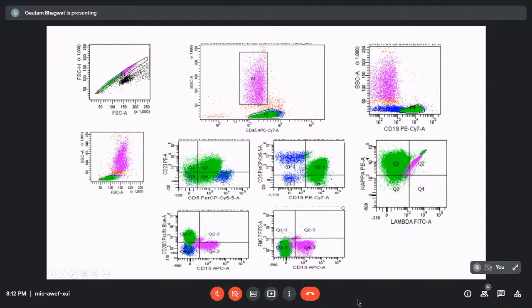In acute leukemia, what we were seeing was all entirely over here. In CLPDs, what we will see would be entirely towards the right hand side of the myeloid, that is moderate to bright expression of CD45. Now here we put one more gate, and that is of CD19. So all my CD45 cells go, and now my population of interest is only CD19. So I gate further as CD19, and I would look only into the CD19 positive cells. What do I see here?